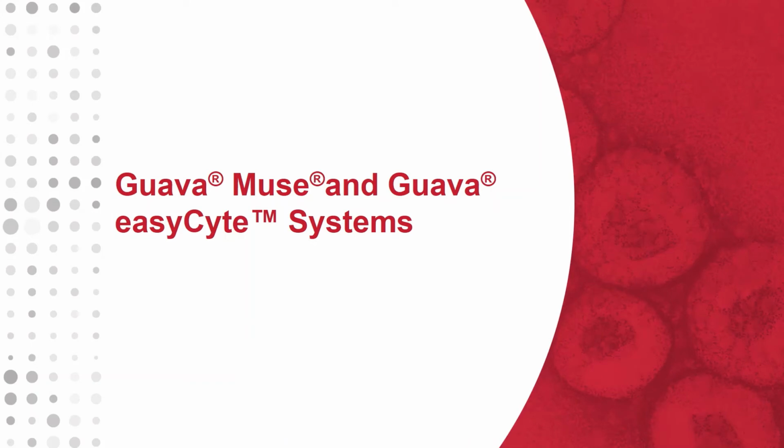First up, we'll be talking about the Guava Muse and Guava EasyCyte systems that have many applications for cell biology, ranging from simple count and viability measurements to more complex population identification, as well as mechanism of action studies.